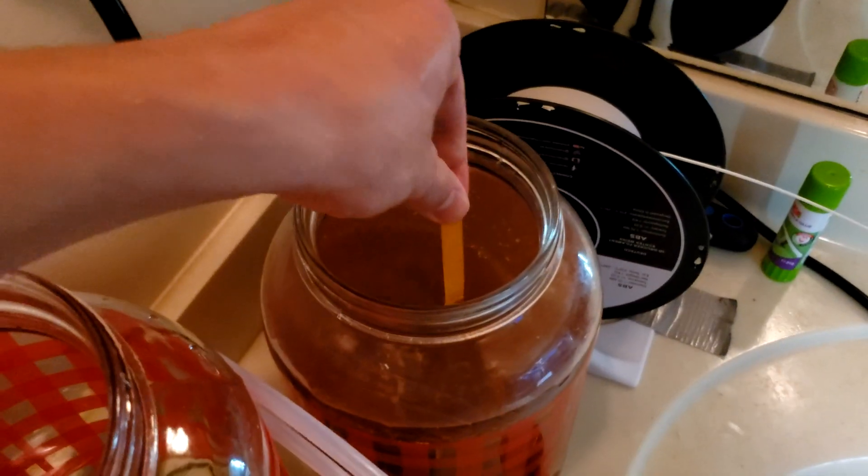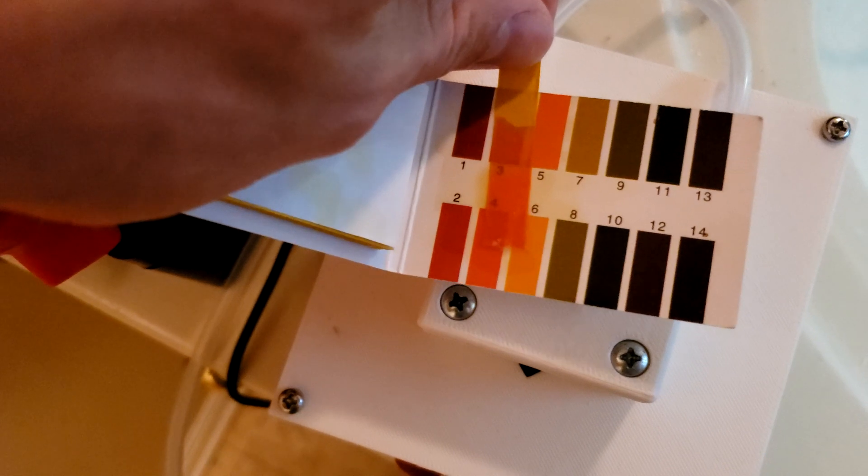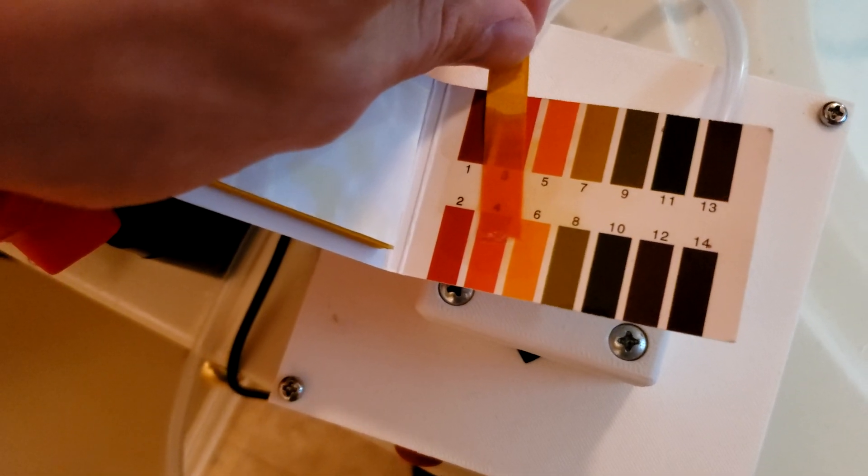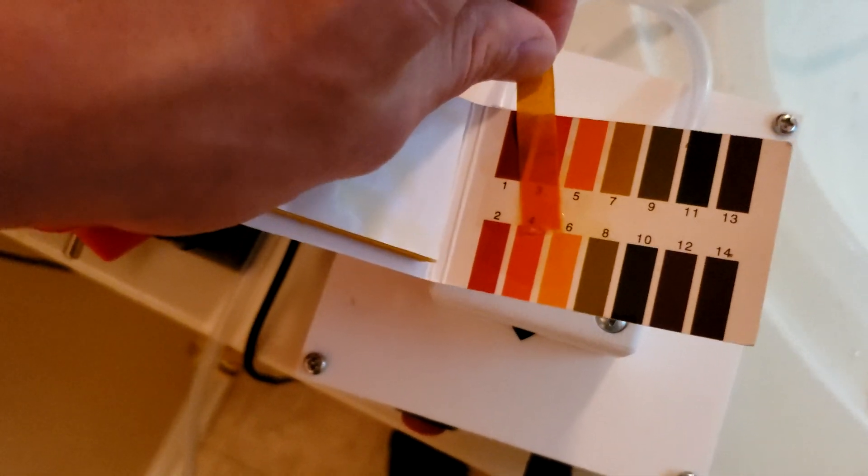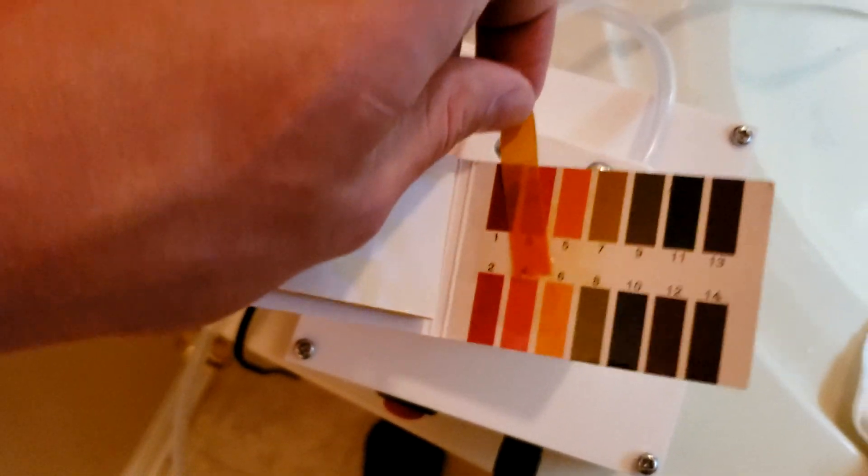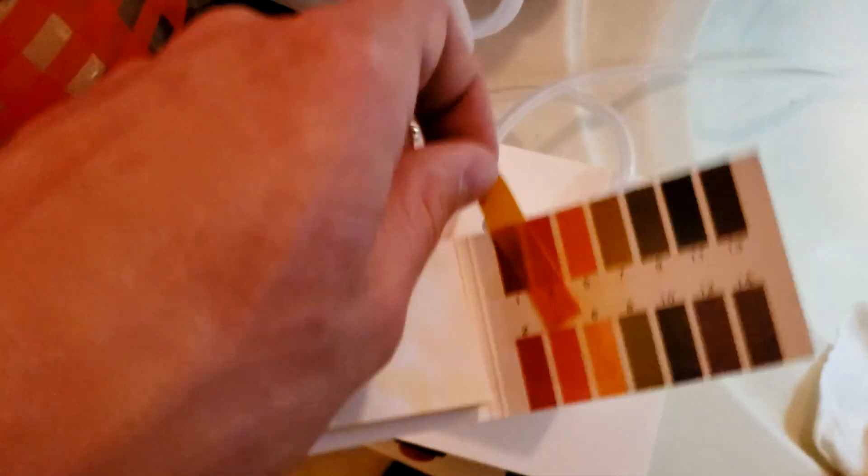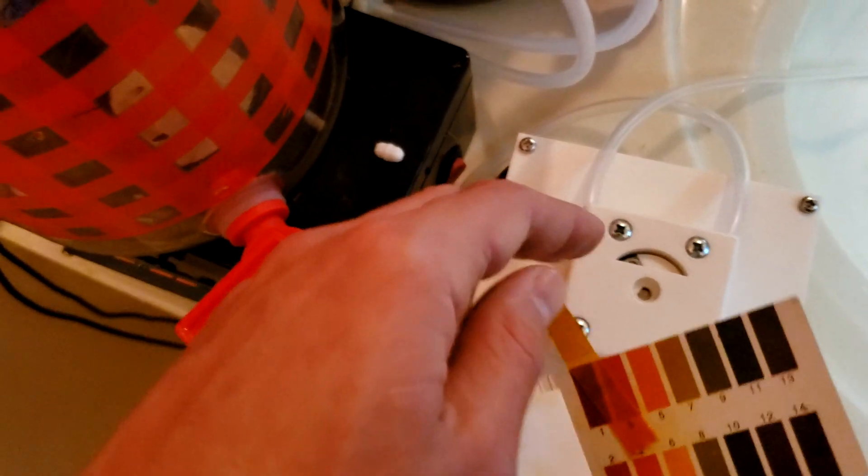Anyway, let's test the pH. So red is a little bit acidic. So you can see we're sitting at a pH of probably around four and a half. That's what I would guess. Kombucha will probably get down to a pH of two or three. So we have some resolution here to actually check if our brew is finished or at least progressing in the right direction.